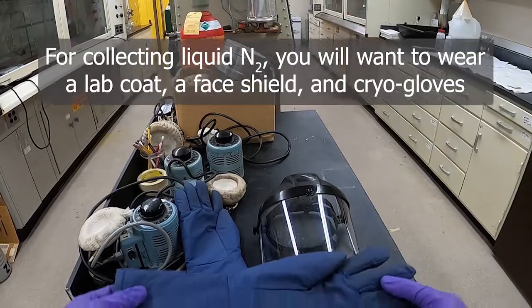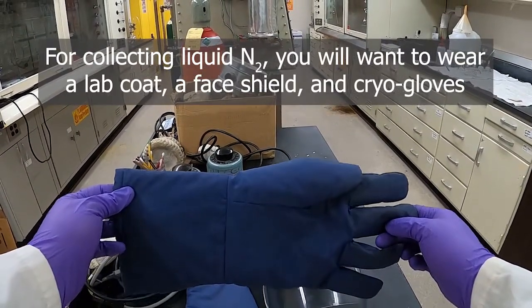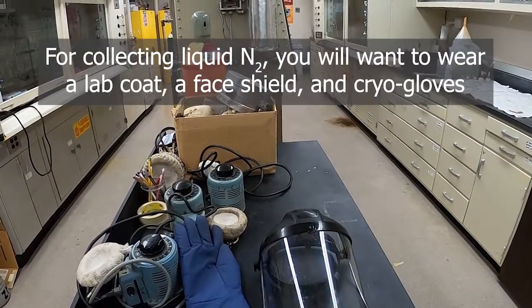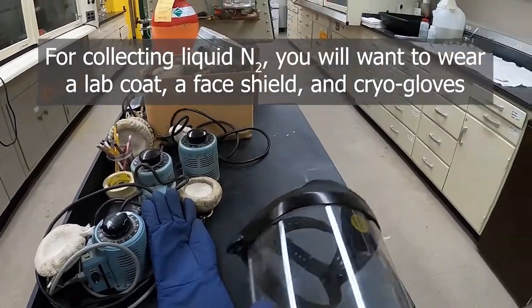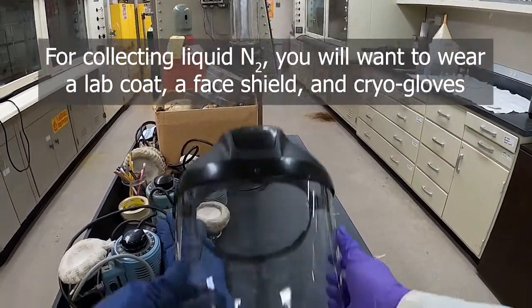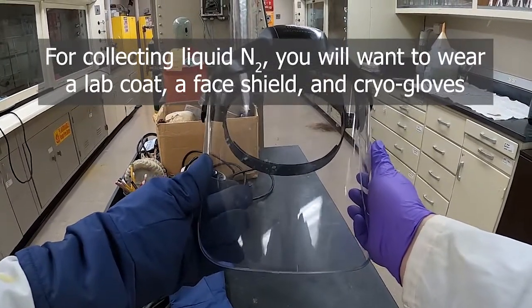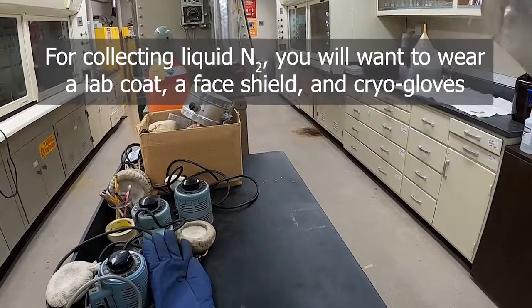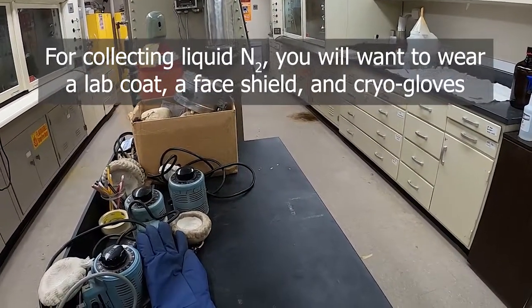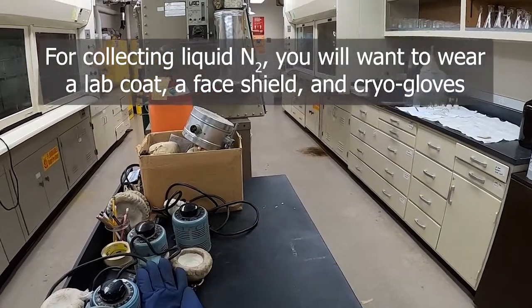So we have these cryo gloves. They're just gloves that will help protect your hands from the liquid nitrogen, from the cold. So go ahead and put those on. And then this face shield, just to protect us also from splashes and just extra protection. Of course, you'll be wearing goggles or safety glasses as well. Goggles are a better idea, I think, required for this lab too.